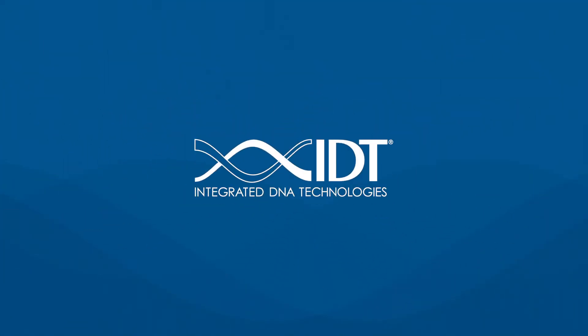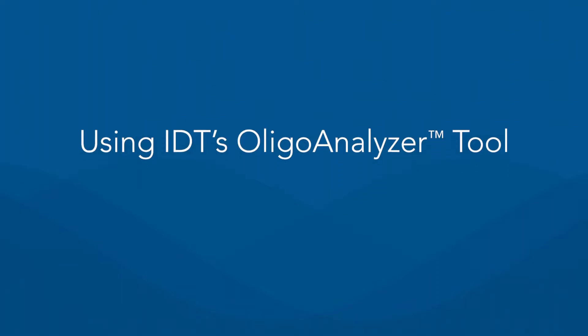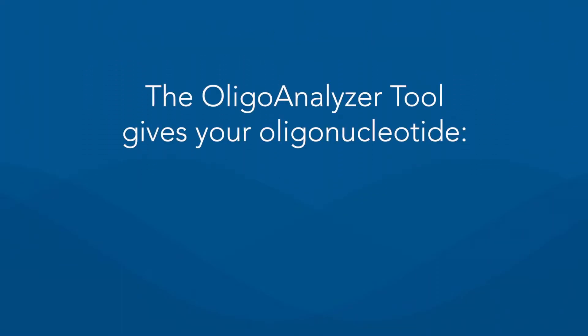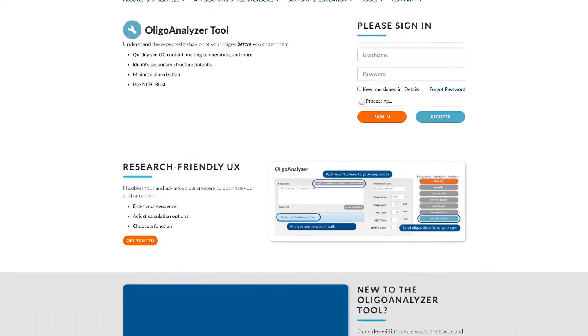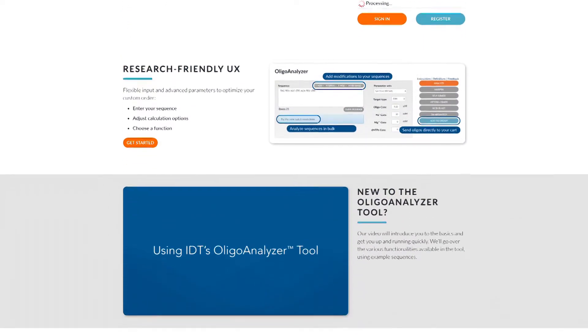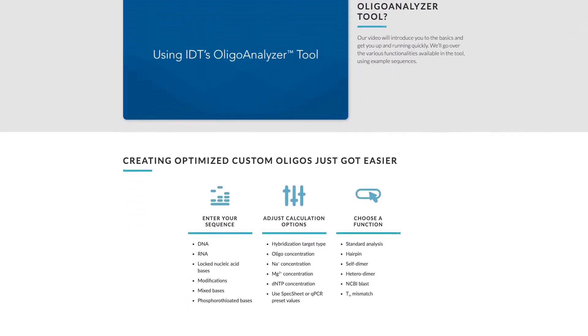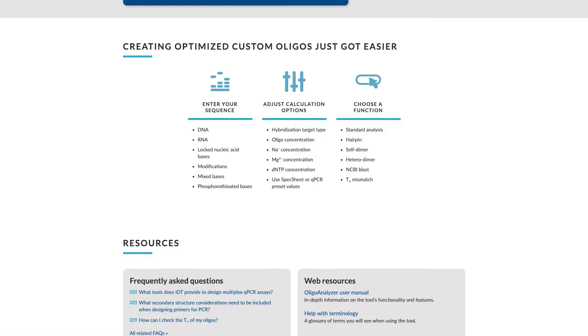In this tutorial, we'll show you how to use the IDT Oligoanalyzer tool to identify essential oligonucleotide properties, including melting temperature, dimers, hairpins, and more. By watching, you'll learn how to use this free online tool to gain insight into the behavior of your oligo sequences when designing assays.